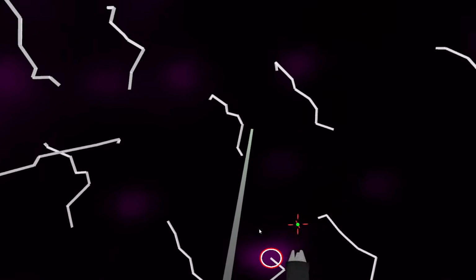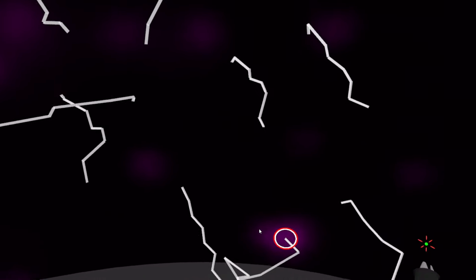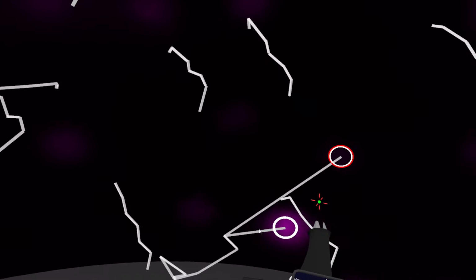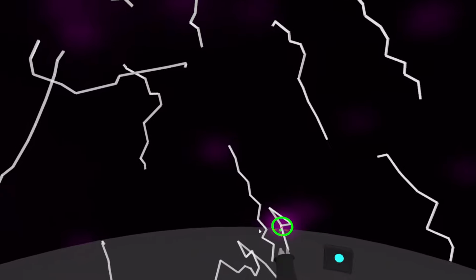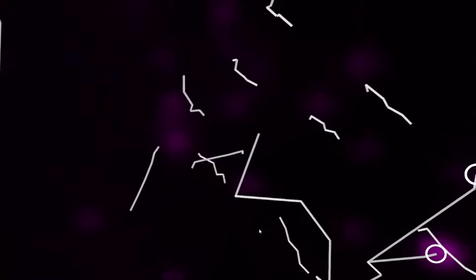So I'm going to unselect and say that this cell here was to divide into this cell at the next time point. So I would just select the previous time point, go to the next time point, click, right? And now we have this Y-shaped track, right? And so I can just then keep tracking the cell, right? And that would basically be this mitosis that would have happened here, right? This is how you basically would do it in any other tracking tool: you can come back in time, then choose to select a particular time point, and then decide that this is a branching at some point from this particular time point, right?